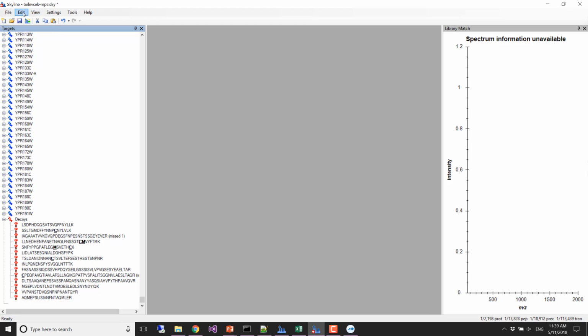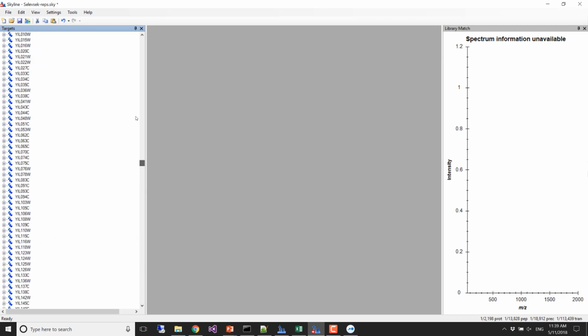Because I'm trying to create a new template. My goal is to have 2 document templates that I'm going to import the osmotic shock into. And I just told you that potentially we could have 4. We could have everything low CV with 5 peptides and low CV with 3 peptides. I'm kind of interested in that one now, but we're just going to do everything in low CV. And this is sort of what I started investigating with Mina, and Olga got pretty interested in as well, and so we decided, hey, let's base the capstone around this idea.